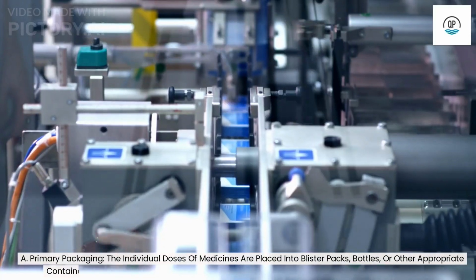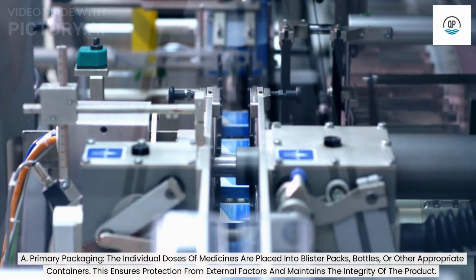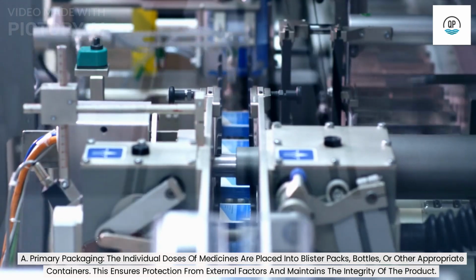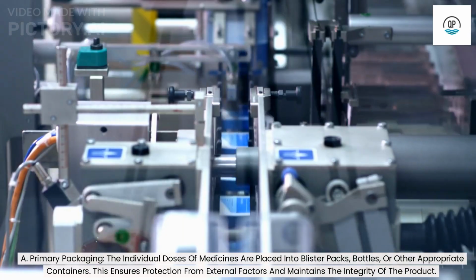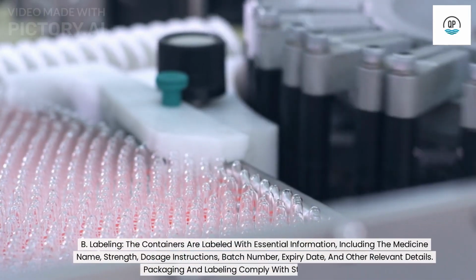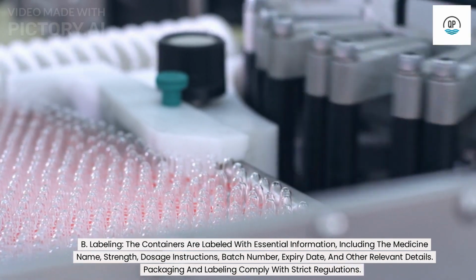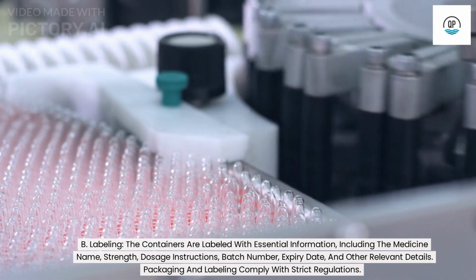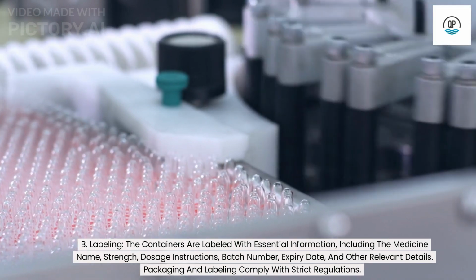After the tablets or capsules are manufactured, they undergo packaging, which involves the following steps. A. Primary packaging. The individual doses of medicines are placed into blister packs, bottles, or other appropriate containers. This ensures protection from external factors and maintains the integrity of the product. B. Labeling. The containers are labeled with essential information, including the medicine name, strength, dosage instructions, batch number, expiry date, and other relevant details. Packaging and labeling comply with strict regulations.